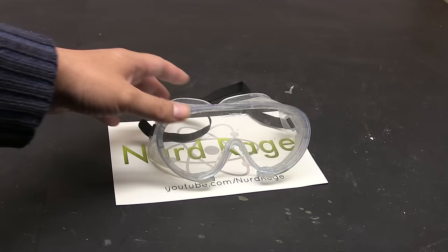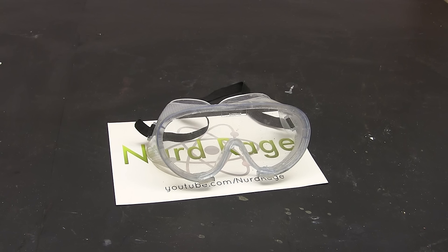Lab goggles are essential, a blind experimenter is not a very good one. Regular glasses are not enough as chemicals can splash all over your face and still get behind the glasses. Wrap around goggles like these ones are what you want. Have a couple on hand in case one gets too dirty or foggy. I know they're annoying, uncomfortable and leave pressure marks on your face.